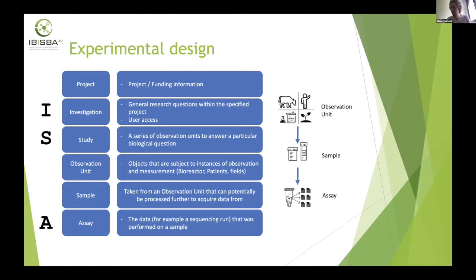So we have project information. So this is then a TNA project. What is the general project about? What are you going to investigate? Do you have one research question, or do you have a multitude of questions? There we also can set credential information, and then into more specifics. What are you exactly studying? So in this case, the co-culture transcriptomics variation between a fungi and a bacteria.